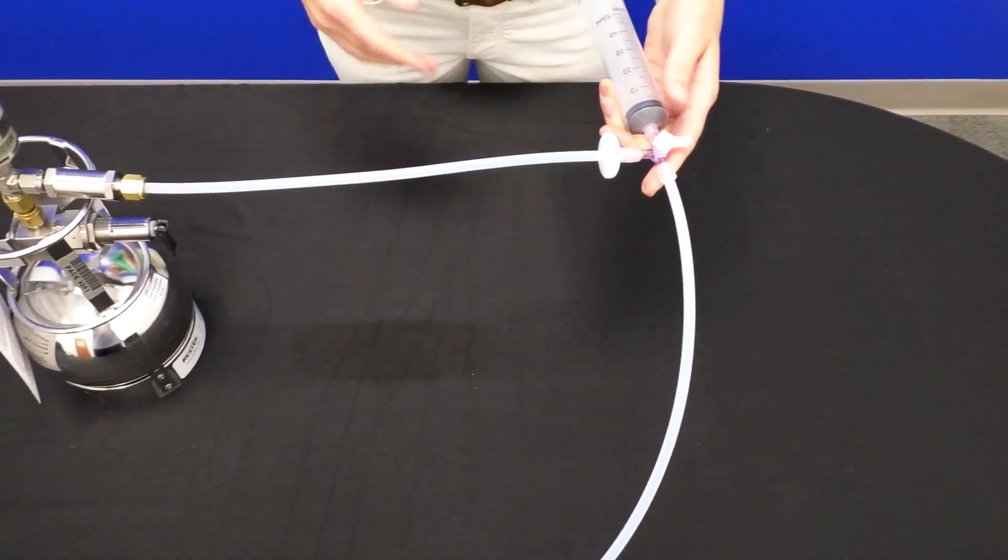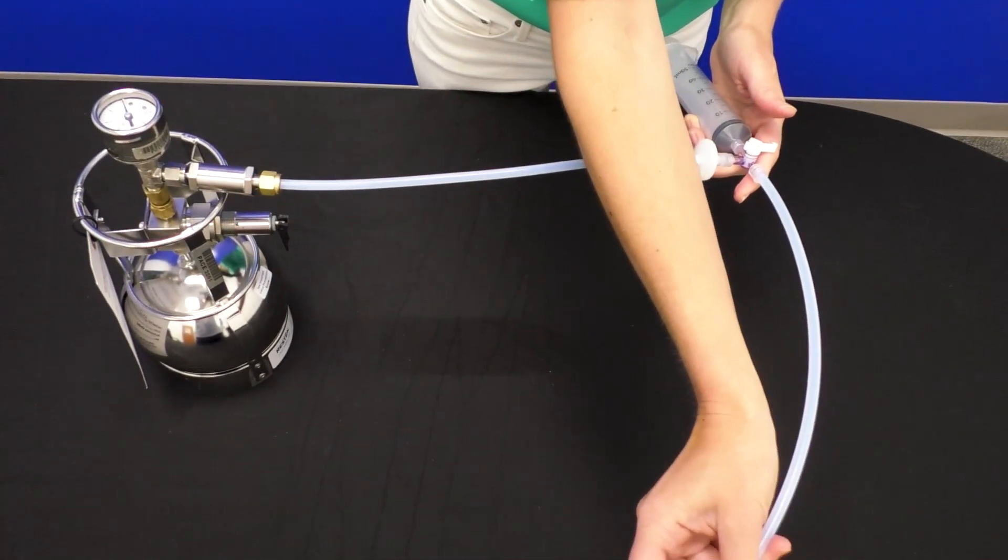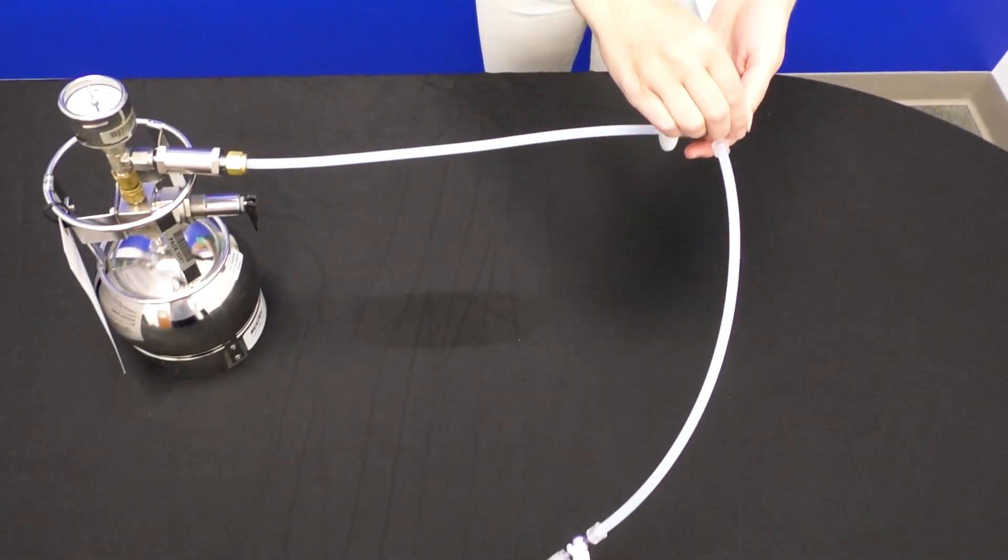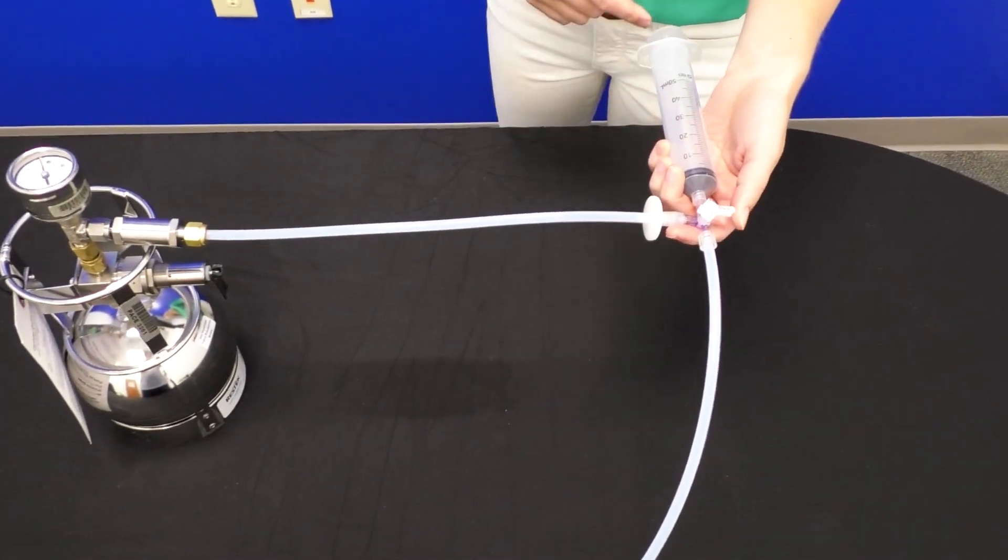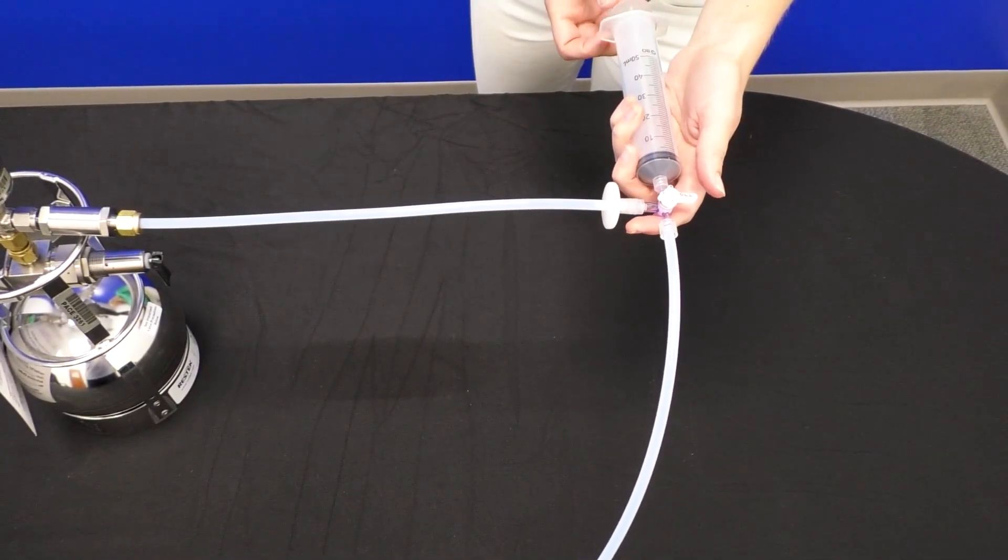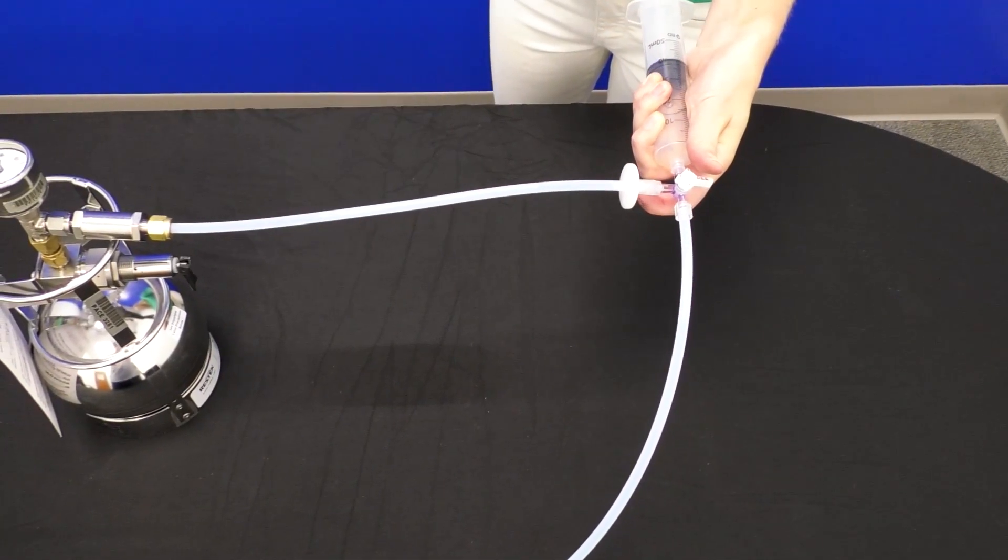And now when you are ready to leak check your system, here we don't have a sampling point so I'm going to close the two-way valve. You'll make sure that the off valve is set to the opposite the T, so all directions are open. And then you will draw a vacuum on the system with your syringe.